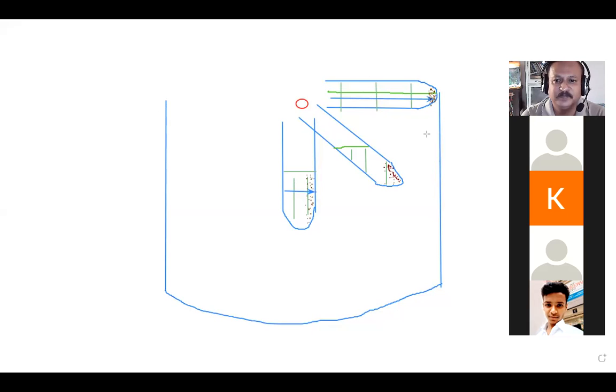Don't know, sir. Yes, Inamul. I couldn't hear you properly. Is it possible or not? Sir, I don't think it is possible because I have seen rotors inclined at 45 degrees only. I have never seen 90 degrees.